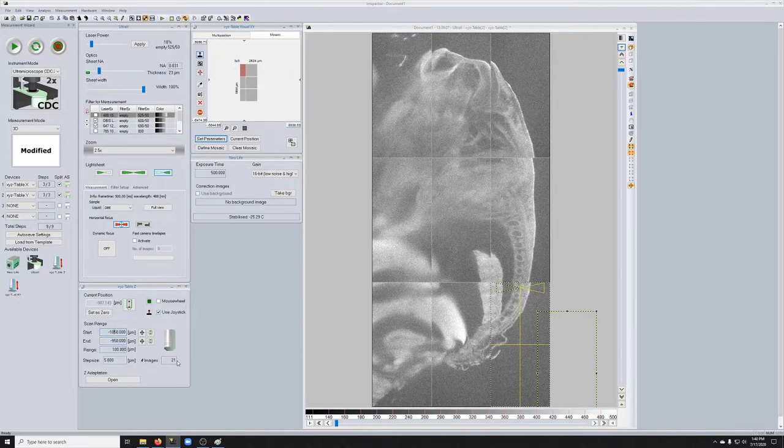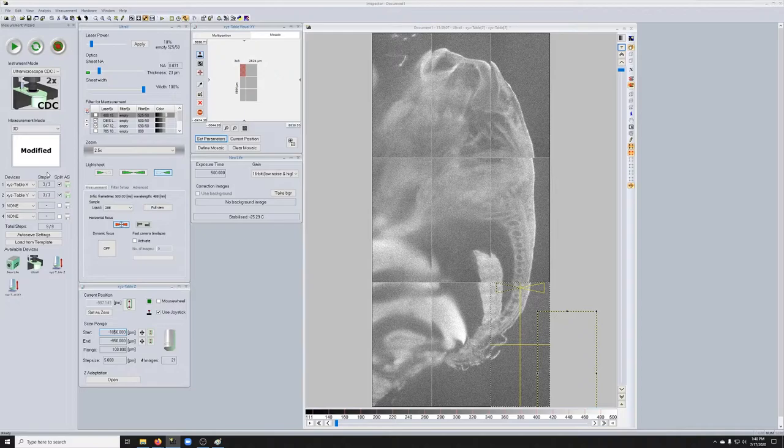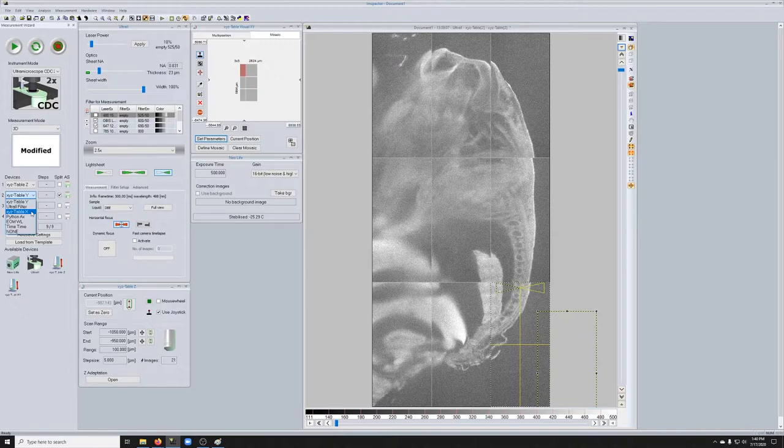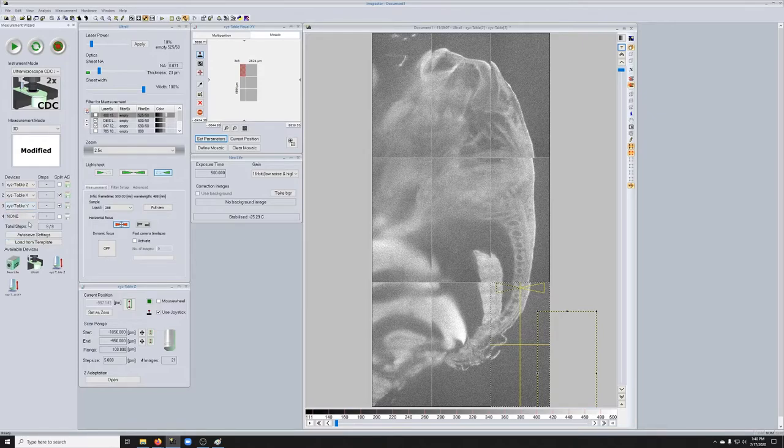So that's 21 images at three by three at nine positions. So how do I tell the software to do this? So first we need to decide on the imaging order. So the typical imaging order will be, we'll do Z first. If we had channels, we would do them after the Z. Since we're doing one channel, I'm not going to bother with that. We're just going to do it with this one to make it a little bit simpler. We would want X and then Y.